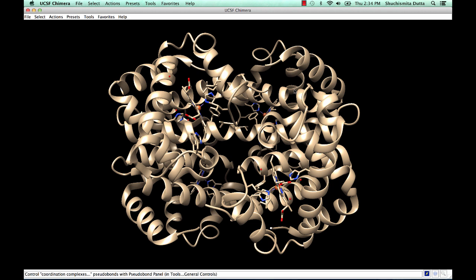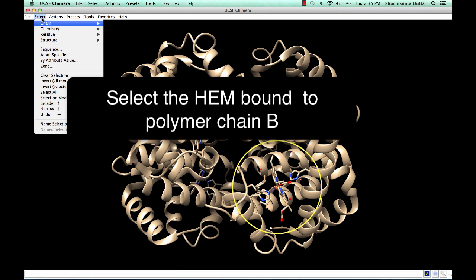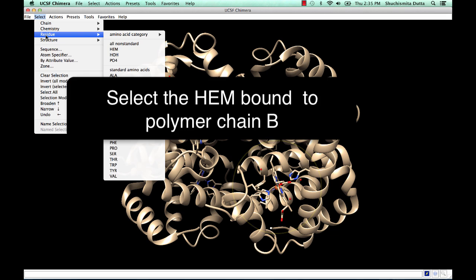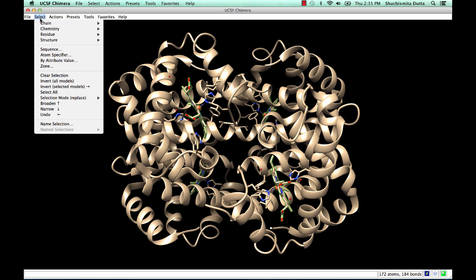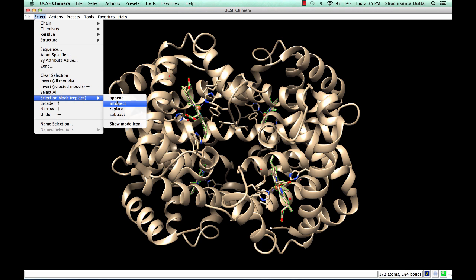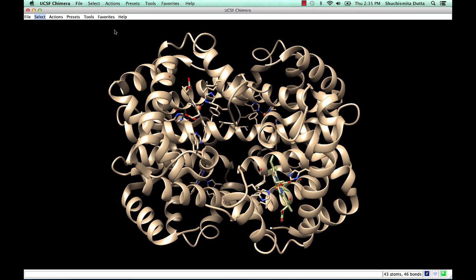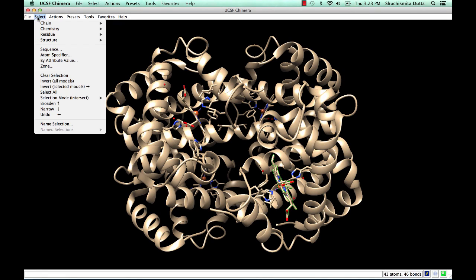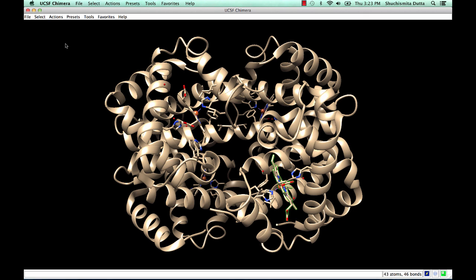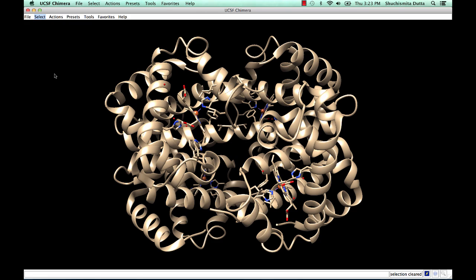Let's say you want to select the heme group associated with chain B. If we select by the residue name heme, notice all four heme groups are selected. So if we now intersect this selection with chain B, only the heme group associated with chain B is highlighted. Remember to reset the selection mode back to Replace and clear selections before proceeding further.